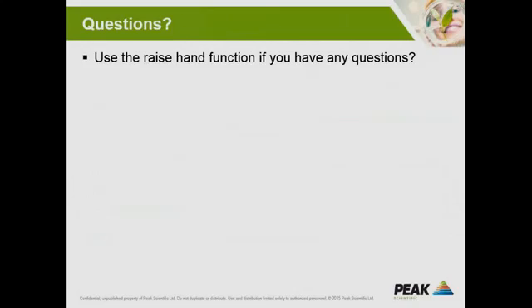Okay. I think that should answer it. Then we have Mr. Praveen Dixit asking, what is the impact of purity of gas on GC analysis?